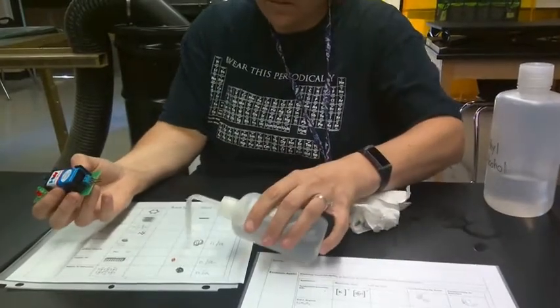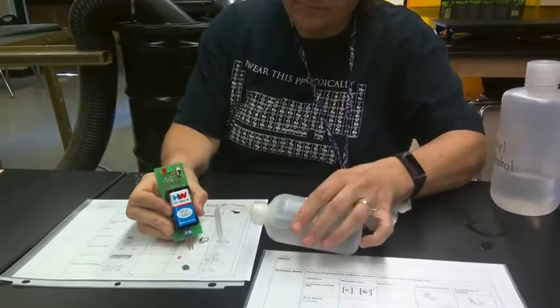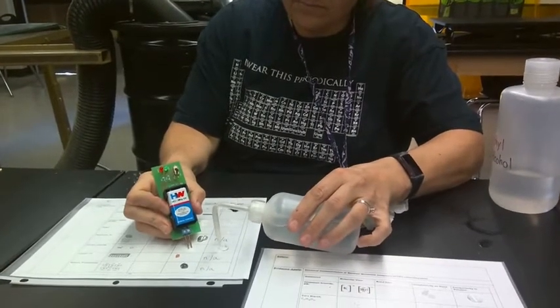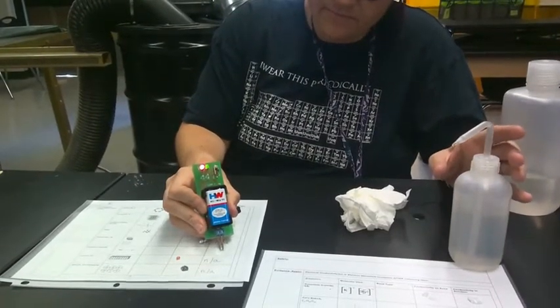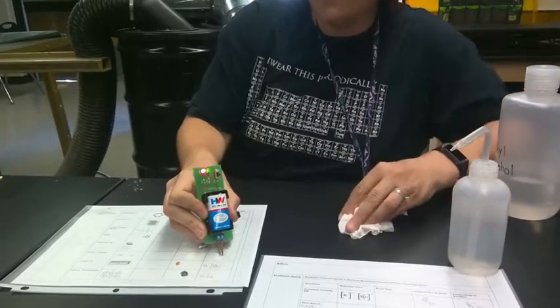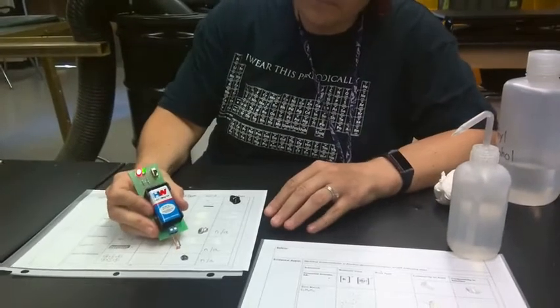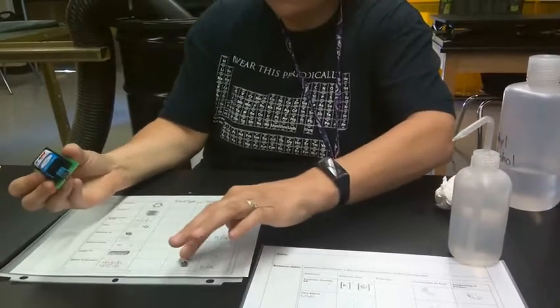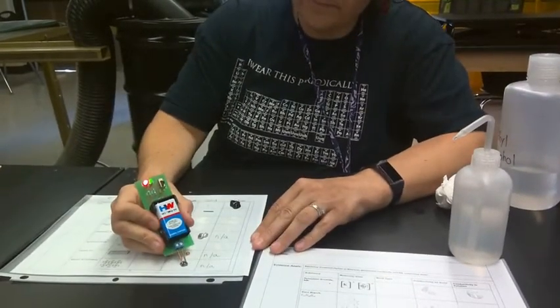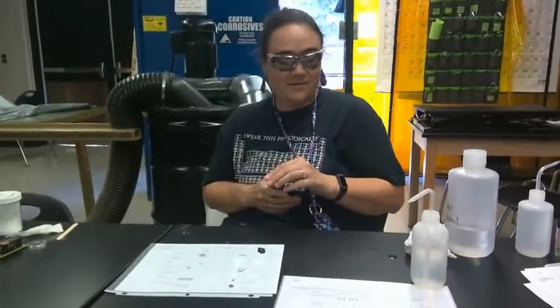Sodium chloride, otherwise known as table salt, as a solid, and in solution. And if I'm going too fast, feel free to pause and move on. Next, we have copper metal. And lastly, silicon. All right, collect your data and complete your analysis. And we look forward to seeing you in class next time. Have a great day.